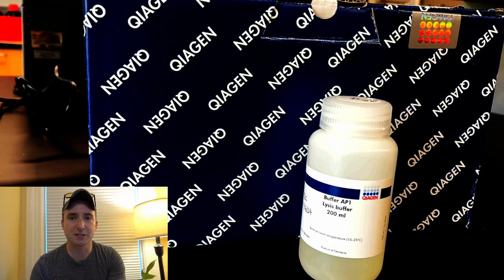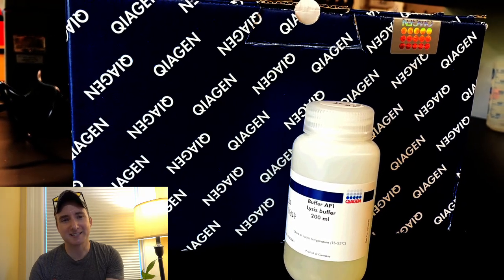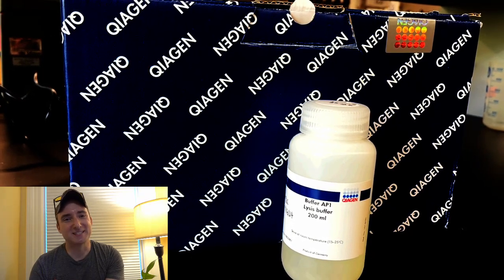So what you do is you take your leaf sample and you drop it into the little centrifuge tube. You add a simple lysis buffer. In this case, we're using a QIAGEN extraction buffer. QIAGEN's not paying me to do this. It's just what we happen to have in the lab right now, and I've never found that the buffer makes a difference using this protocol.